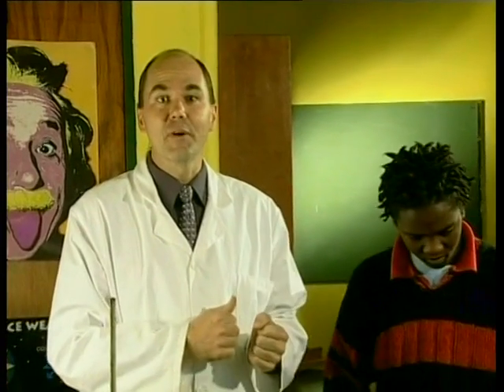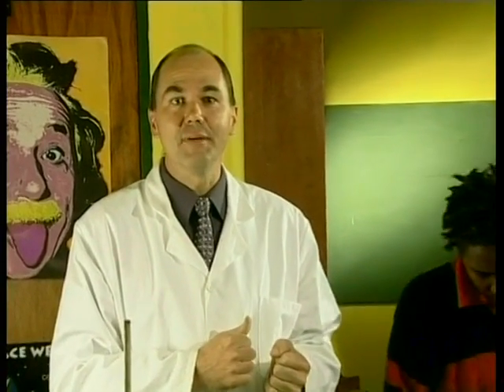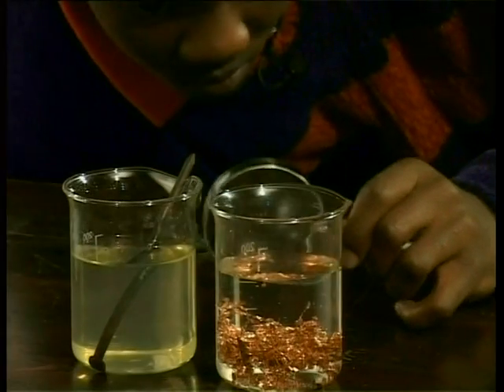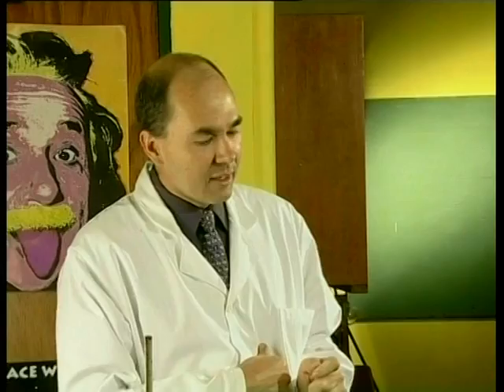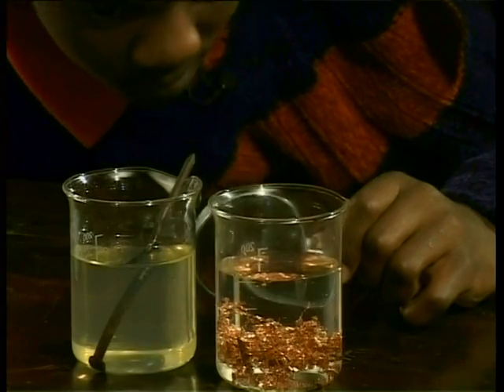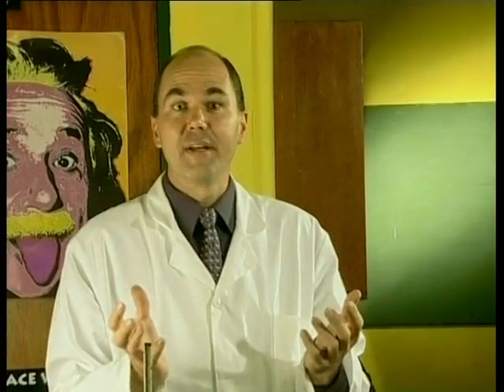We've just taken the experiment out of the cupboard. Seb was looking at the copper right now. Can you see any difference? No, it's still the same. So copper doesn't react with water at room temperature.